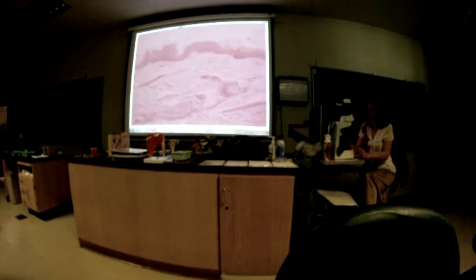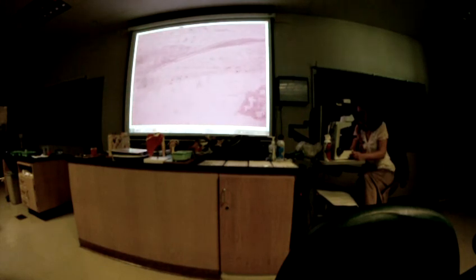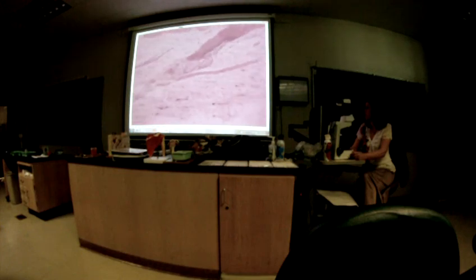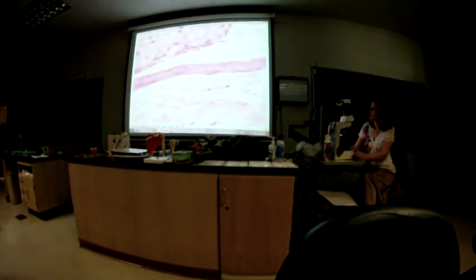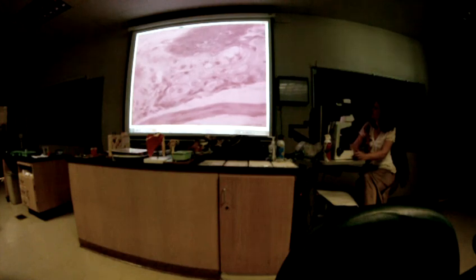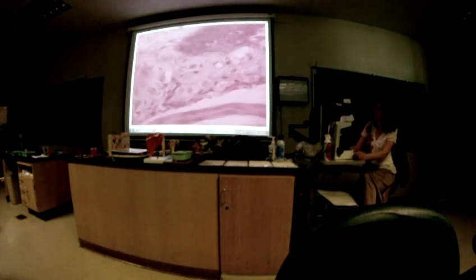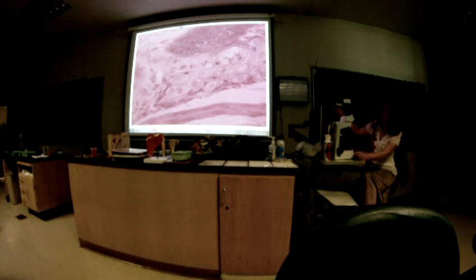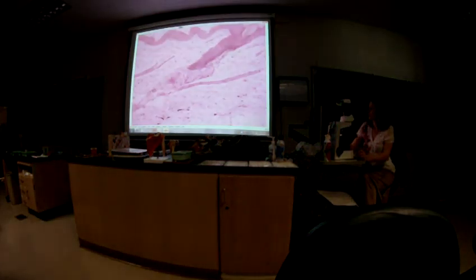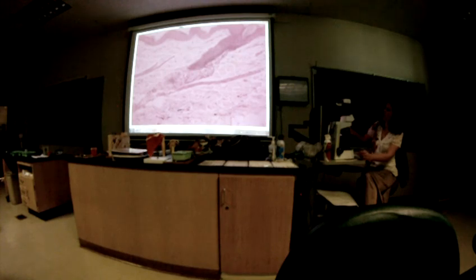So, how do you tell the sweat gland from the sebaceous gland? Does it always have a larger lumen, or the sebaceous gland doesn't have a lumen. You see the kind of bubbly, let's see. This will be the last thing we're going to look at here, because then we got to go. That's the sebaceous gland up close. Okay. Kind of more bubbly looking cells with the nuclei in there. So these are the sebaceous gland cells. And so from further away, it looks like that. Okay.